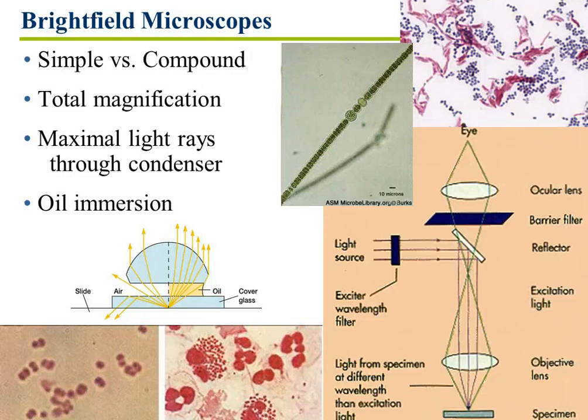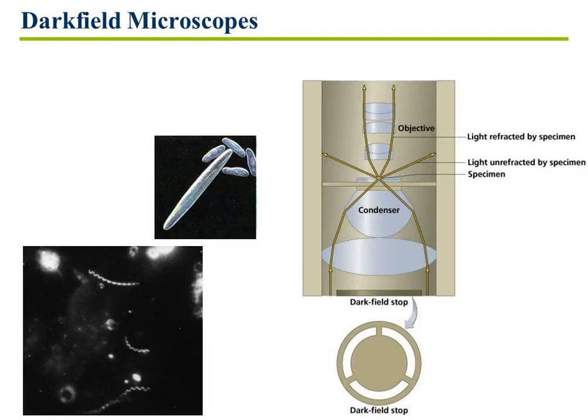Also in your microscope, of course, you've got mirrors so that the light rays hit the mirror and then are projected up to your ocular lens and your eye.